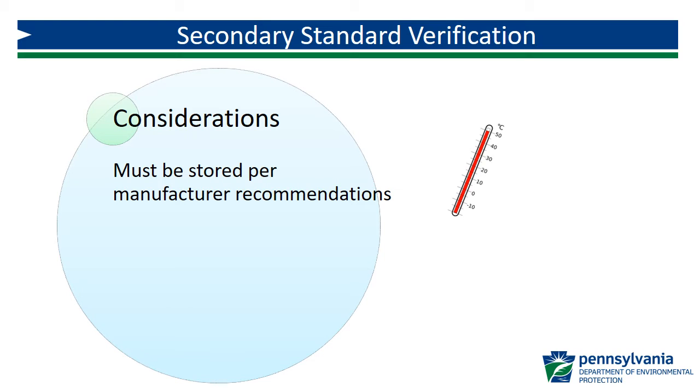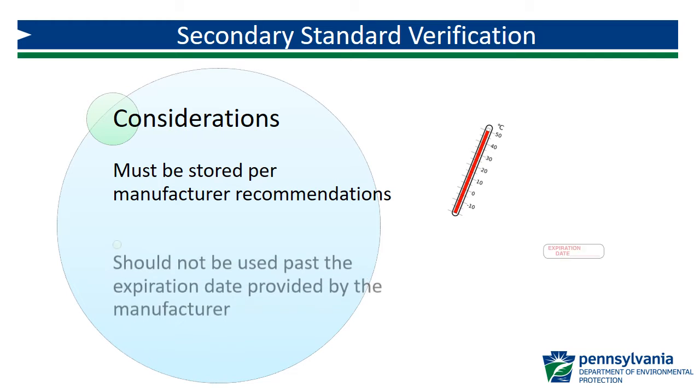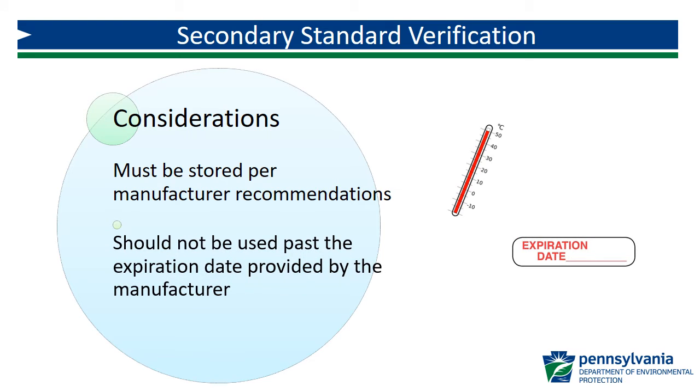Secondary standards must be stored according to manufacturer recommendations. Temperatures above or below the recommended range can cause the individual standards to crack, shatter, or the gel to peel away. If this happens, the standards must be replaced. For gel standards, storing them on their side can also cause the gel to peel away from the cell. Secondary standards have an expiration date and should not be used beyond that date.